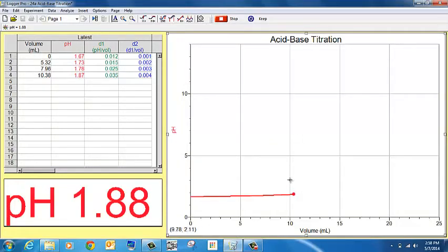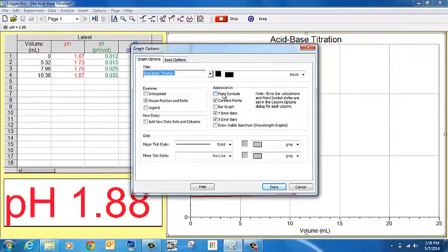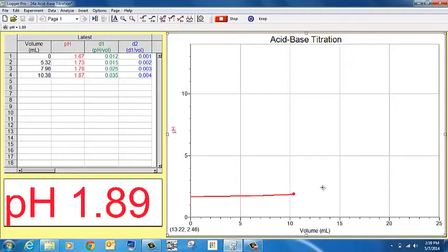If you're getting dots for your data, then you can click on Options over here, Graph Options. Unclick Point Symbols and click Connect Points. This is one of the very few labs where it's OK to have a connected dot type of graph. And we'll keep doing this until we get a complete pH curve.